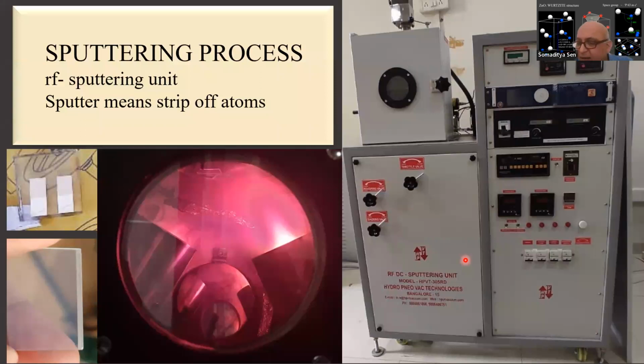Now, recently, in the last 1.5 years, we have started making thin films in our lab. This is a sputtering process. In sample preparation, I started with sol gel. So we make modified materials using the sol gel synthesis route. And with that, if the material is interesting, then we make a target of, say, 10 grams of this material and make it into a small pellet of 2-inch diameter, and we use it as a target material.